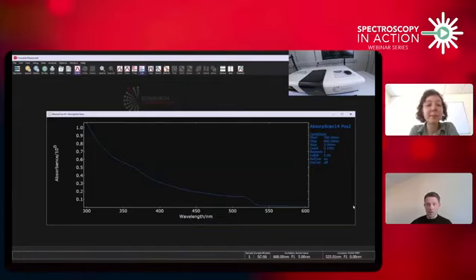So if you're wanting to measure fluorescence, like we will do shortly, and you have a path length of your cuvette of 10 millimeters, you ideally want an absorbance value of about 0.1 at the excitation wavelength. And this is to avoid the inner filter effect. So I would choose an excitation wavelength between 450 and 500 nanometers in this case.